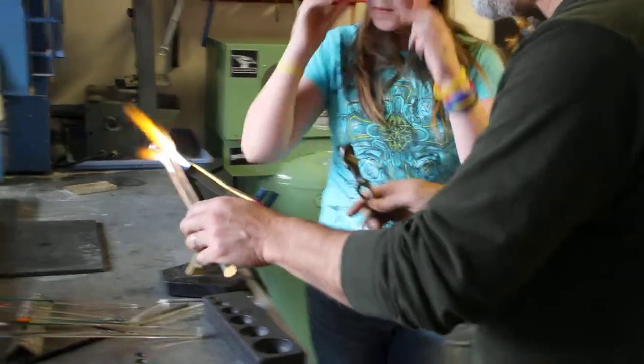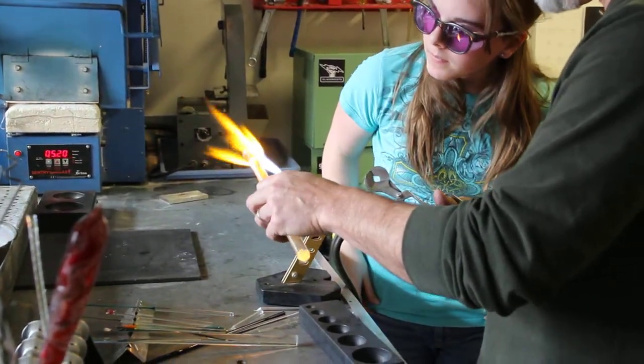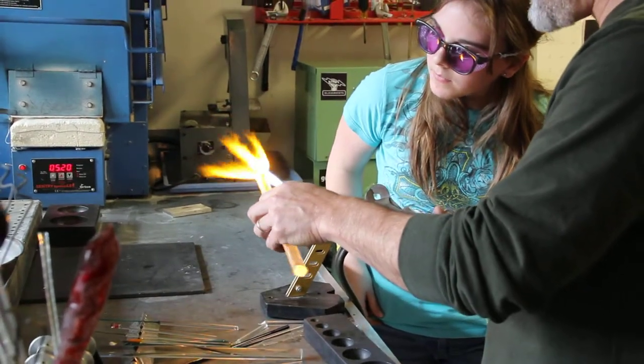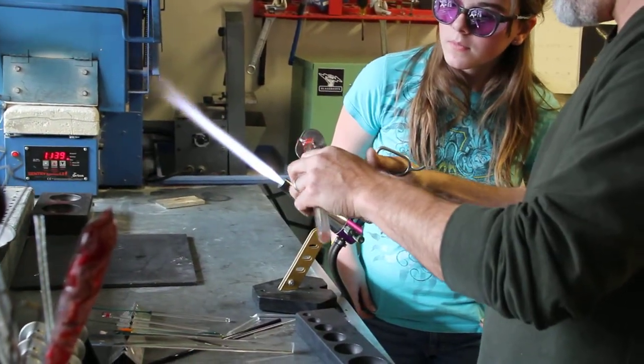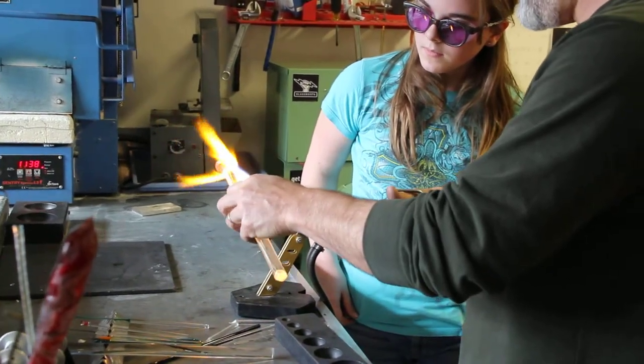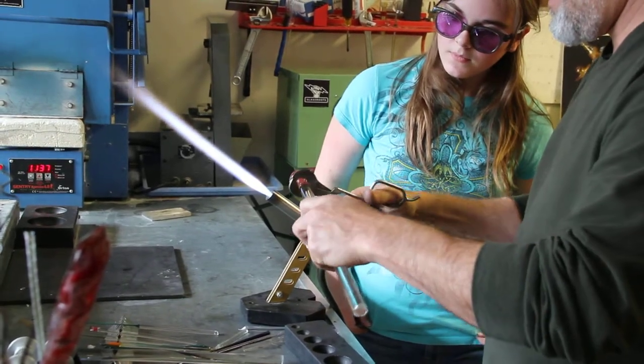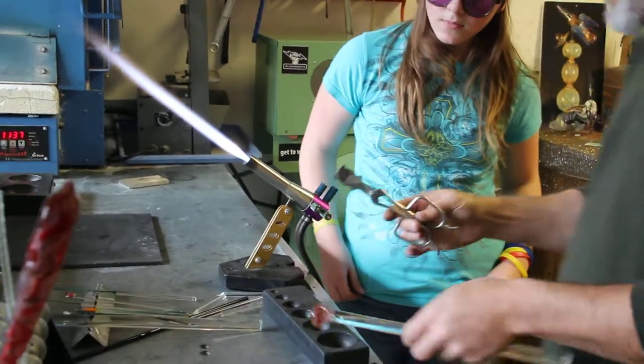I think what happens is sometimes it is too hot, you don't get the right... It's very pretty. It's mostly not. You want that to be really closer to the top. We've got a break in the right place.